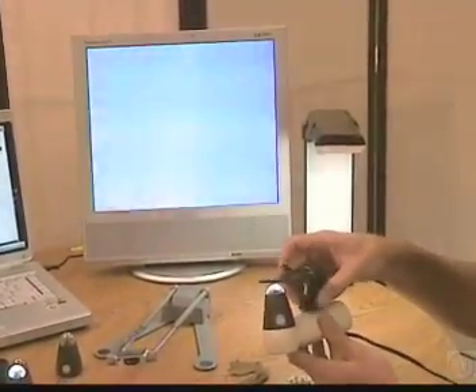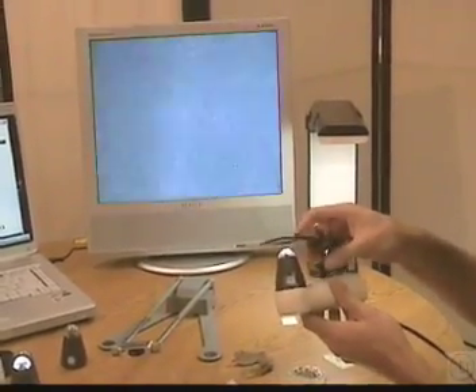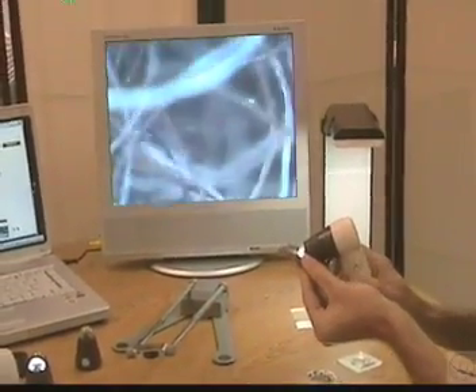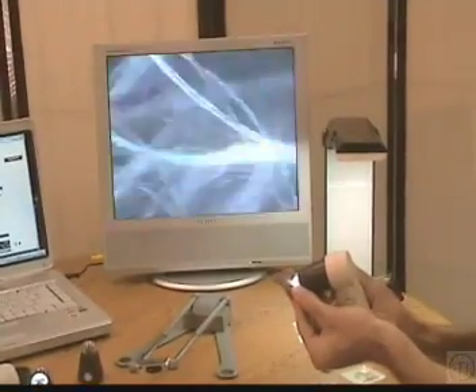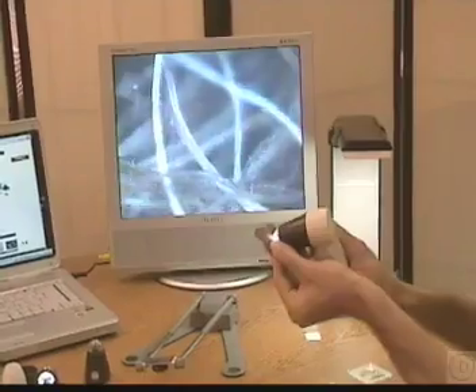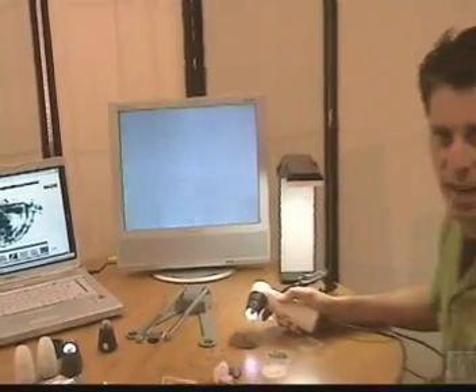Now I'll go back to the handheld mode with the Scope on a Rope and show some yak wool at 200x. With this you just touch and the image is displayed live on the television set instead of on the computer. Go ahead and take a look at the rest of the site and our other products, and give us a call if you have any questions.